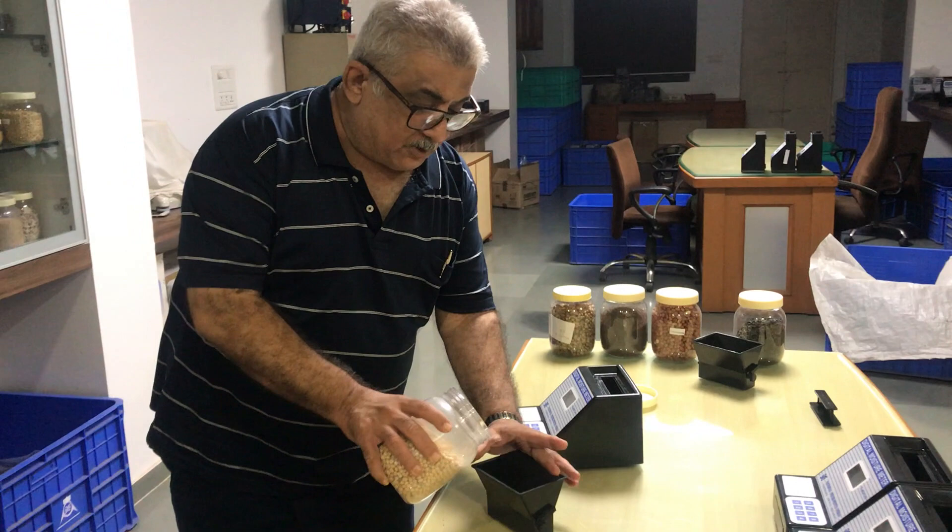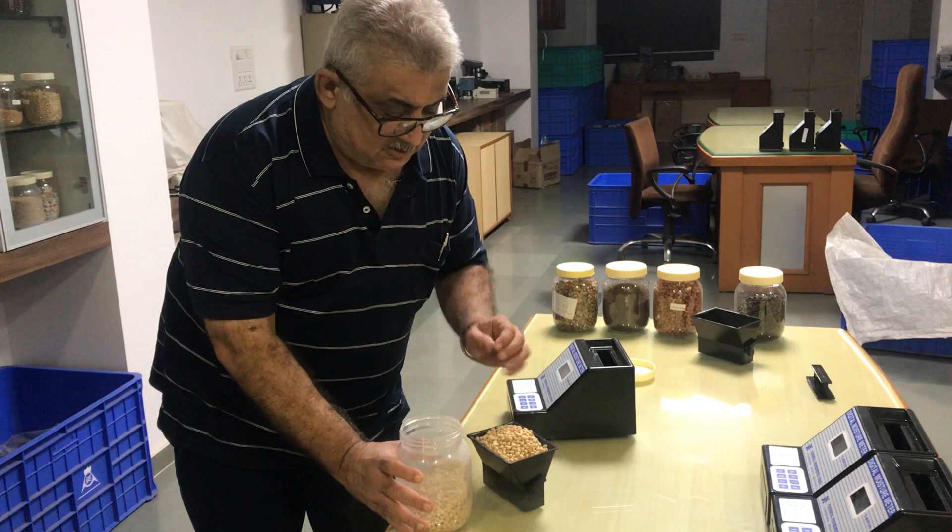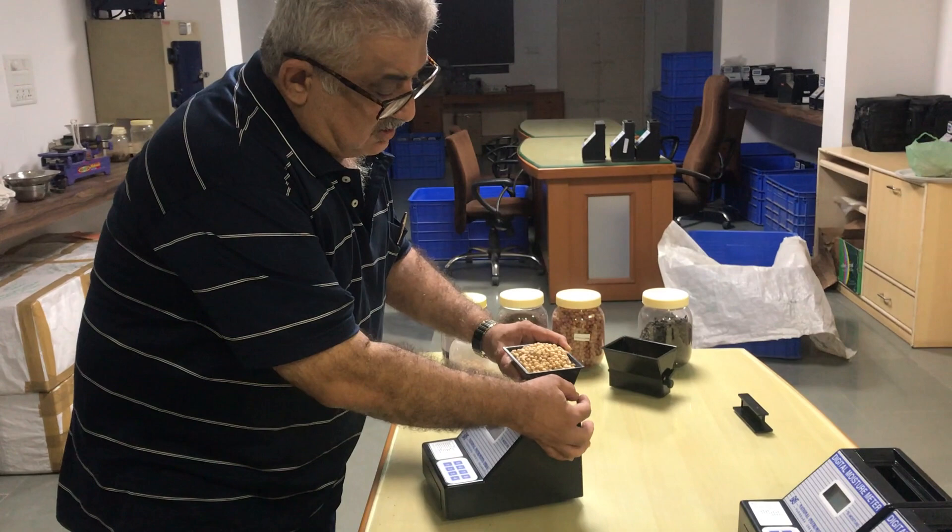This is the hopper. You have to fill the full volume of the hopper with the soya bean. Now you have to just pour this layer into the machine.